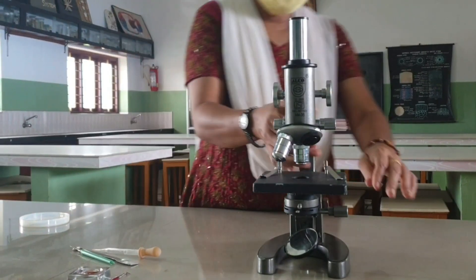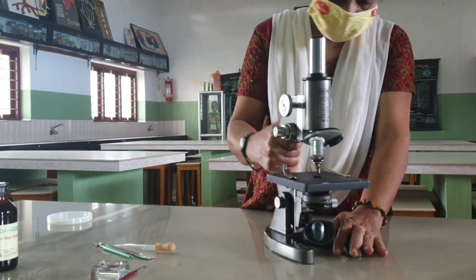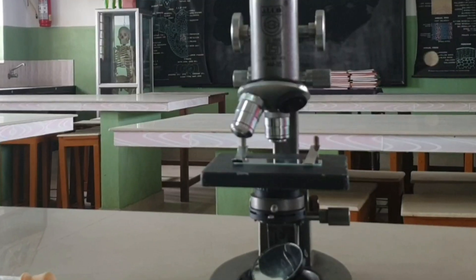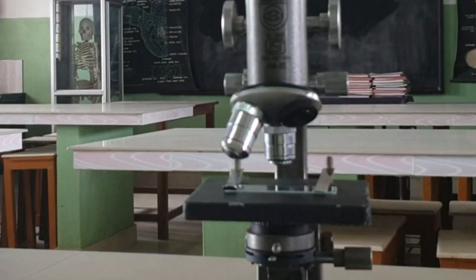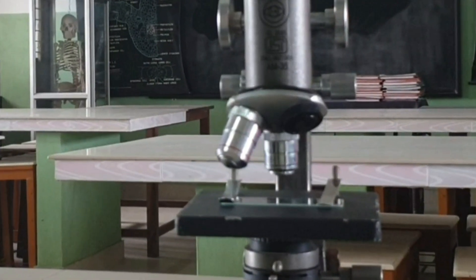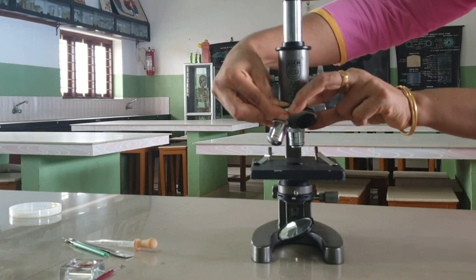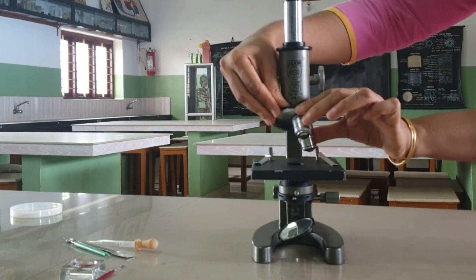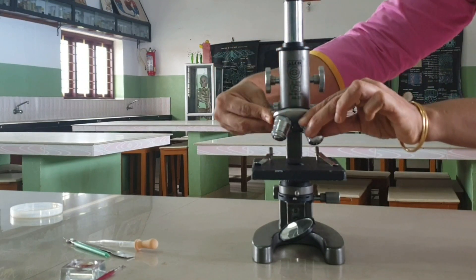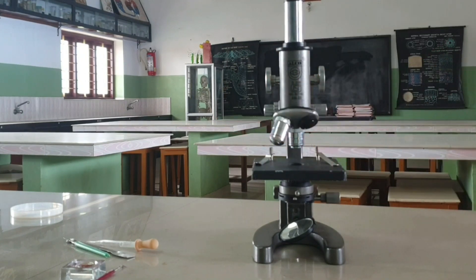Working of Microscope: first of all, adjust the mirror so that sufficient amount of light enters into the microscope by seeing through the eyepiece. Then keep a clean prepared slide in the center of the stage. Use clips to fix the slide on the stage so that it does not move. Move the coarse adjustment screw to bring the slide in focus. Focusing should be made sharp by the use of fine adjustment screws. We normally use the microscope in low magnification. To use high magnification, first adjust in low magnification and then change into high magnification.